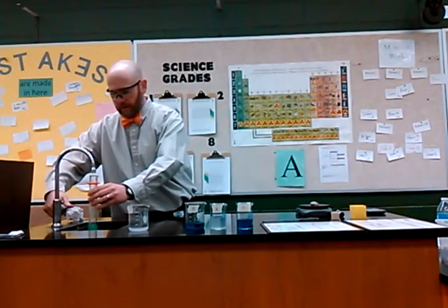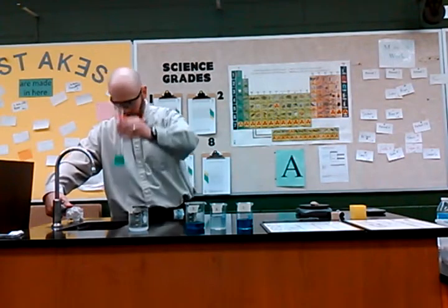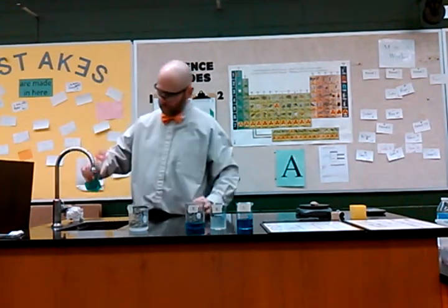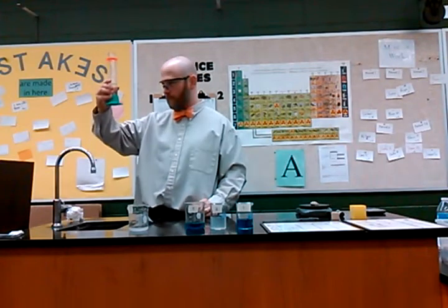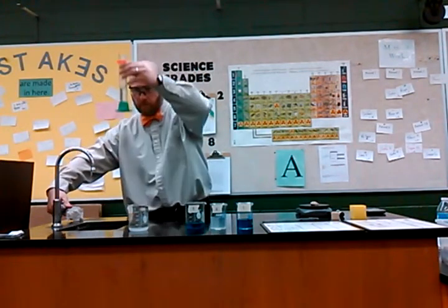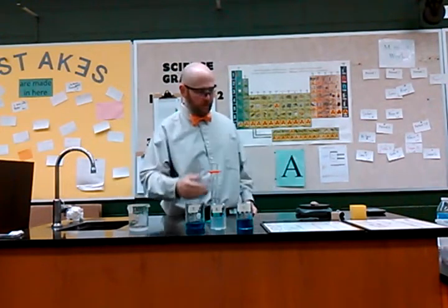I will then take the graduated cylinder and I will put 50 milliliters in the graduated cylinder.